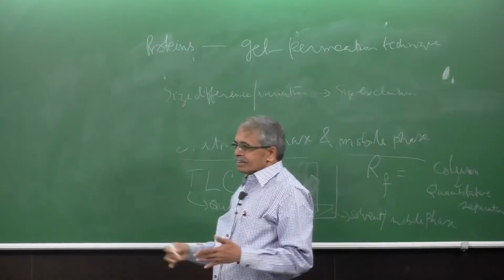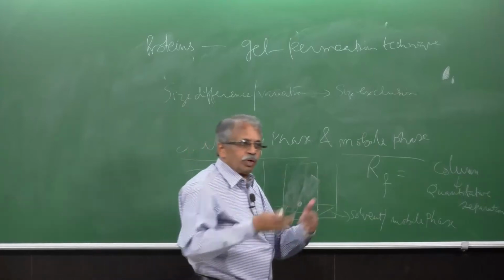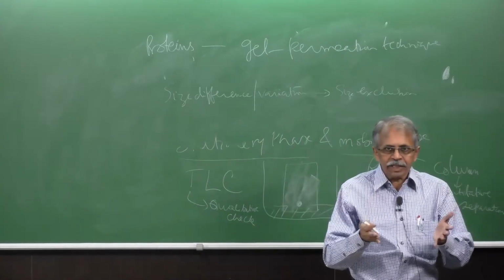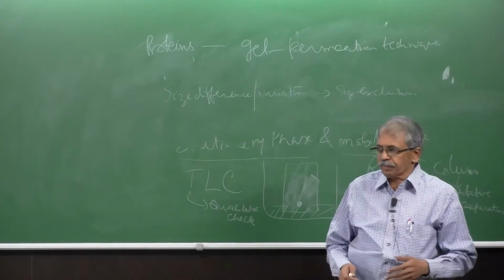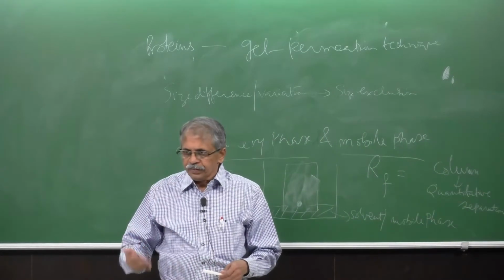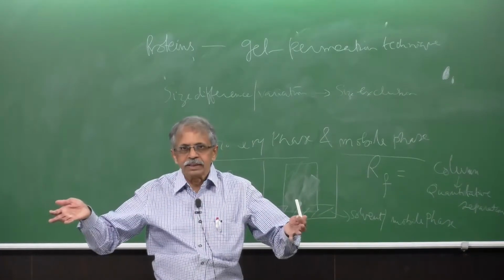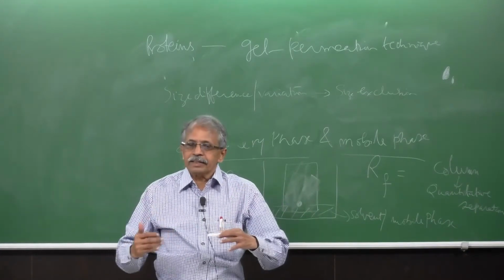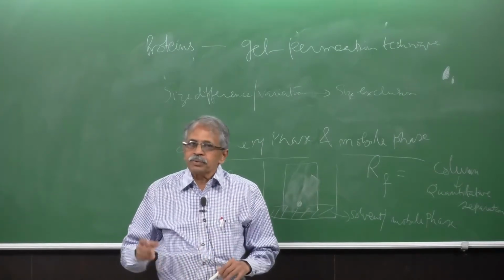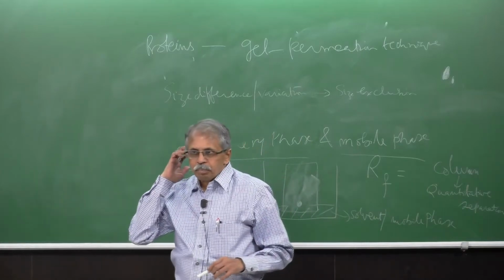So certain sizes are excluded, certain sizes are included into the bed material. Bed material means the stationary phase. So that's what you refer to as a bed material. So inclusive and exclusive: exclusive means they are outside the stationary phase, and inclusive means they are inside. So using this size exclusion principle, you can separate them.